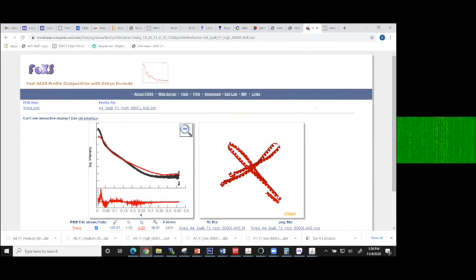But you can now adjust this PDB, adding dimers and heteromers or whatever, and try to find some PDB structure that you built that more resembles what you've measured in solution. And obviously you don't have protein 2 here, but anyway. That's how you'd work back and forth.